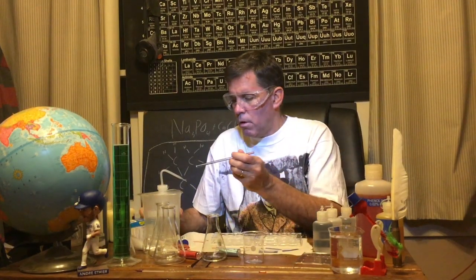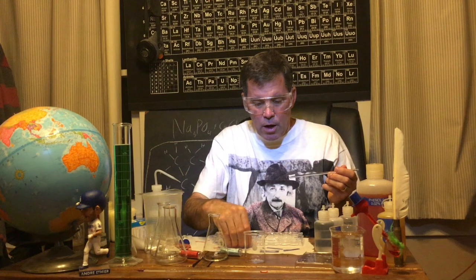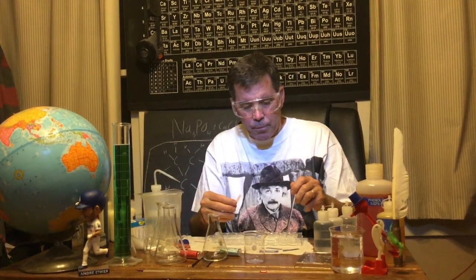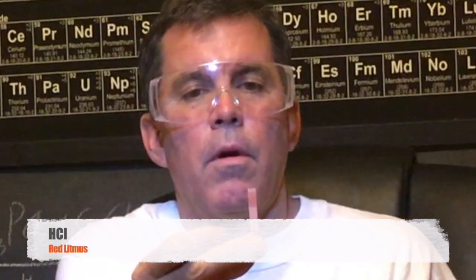Okay. Now let's try the hydrochloric acid. Get a little drop on here. So what color is litmus in acid?